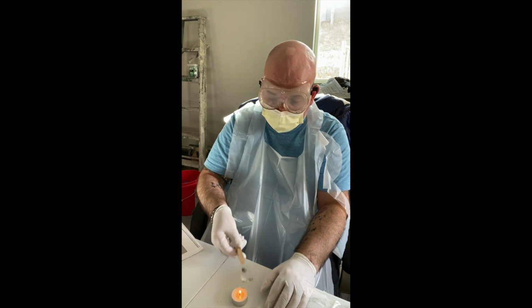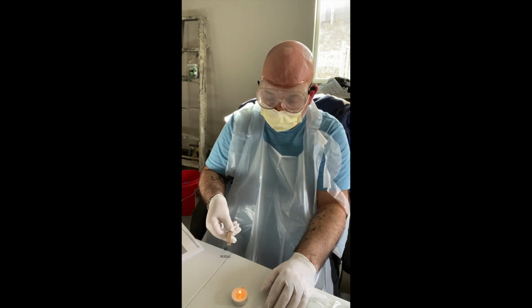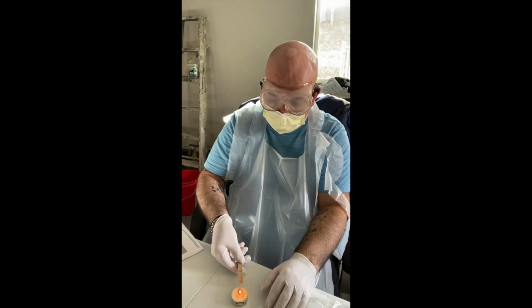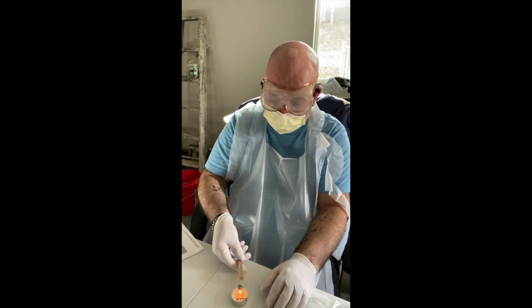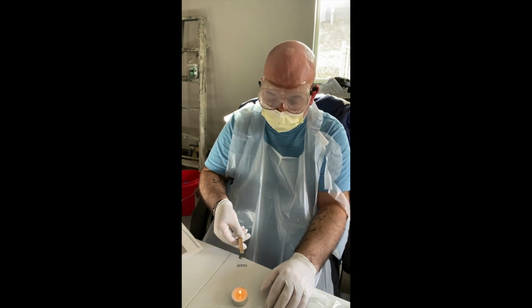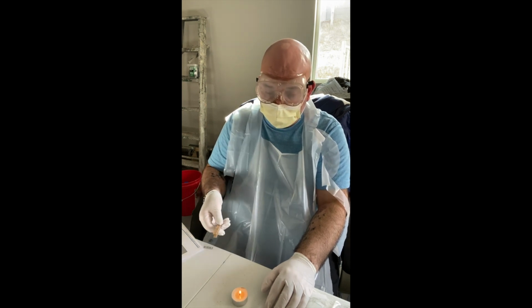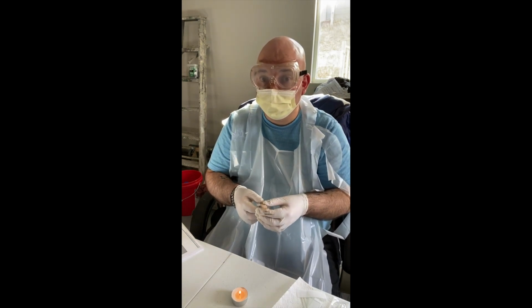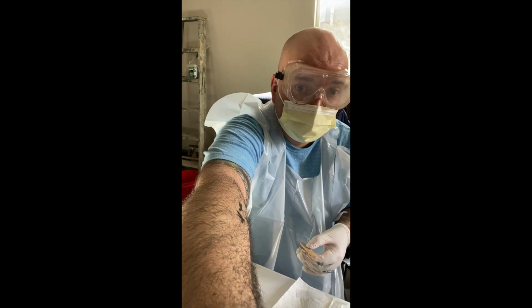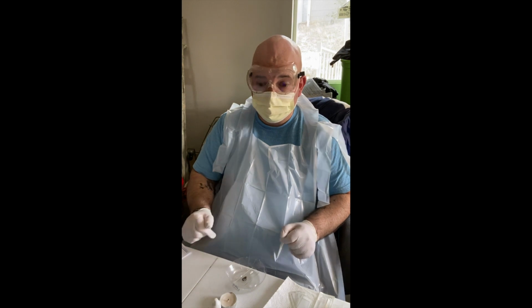Alright, so that's one pass. Two. Three. Four. And 5. Alright, so the slide has now been heat fixed, and I need to let the slide cool completely. Okay, so my slide has now cooled for a full 10 minutes.